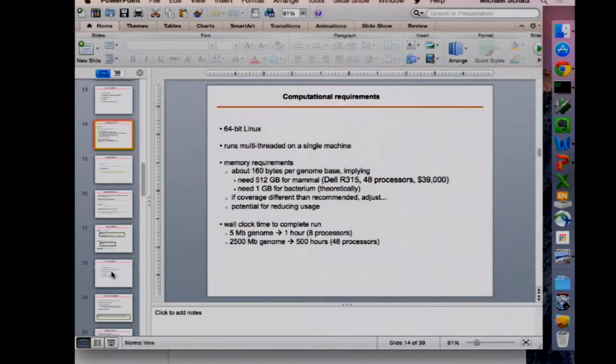So I used the supercomputer at the Pittsburgh Supercomputing Center called Blacklight that has 32 terabytes of RAM. I ran that out of RAM. So then we had to do a bunch of filtering to try to downsample the repeats, because it had to spill the transposable elements. We let the assembler run for like 3 months on 1,000 cores and then it finally completed. So I believe that is the biggest all-paths assembly that has ever been attempted.